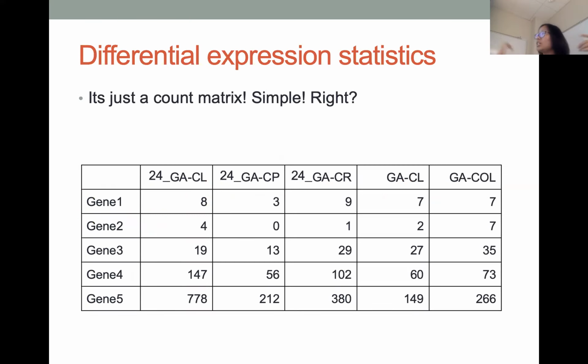Okay. So after HTSeq count, we have already generated the count data, where on the rows you have all the gene names, and on each column you have the sample ID, which seems very clear. But when we start to think about doing some statistical analysis, we want to compare if one gene is differentially expressed between treatments, right? If these first 3 samples belong to one treatment and these 2 belong to another treatment, can we just do a t-test to test the treatment impacts, do you think?